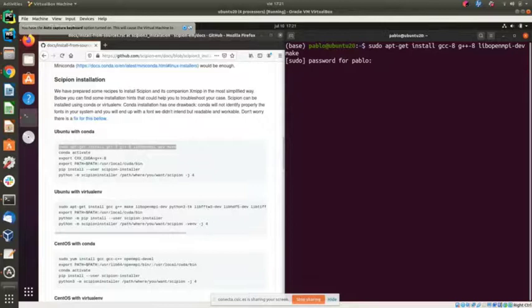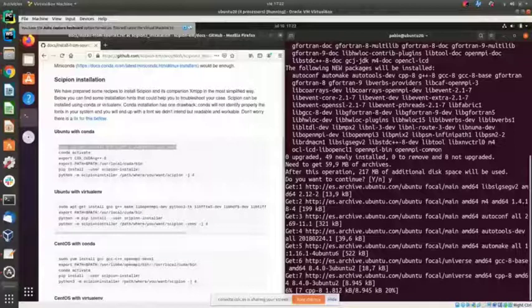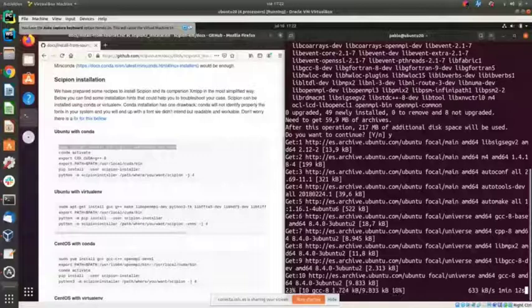While I'm waiting for this to finish, you can go to the survey and fill it in. This is the normal step of installing libraries — it's just taking a while.